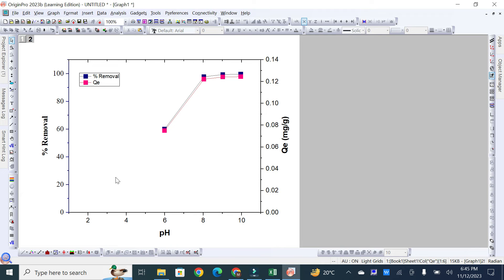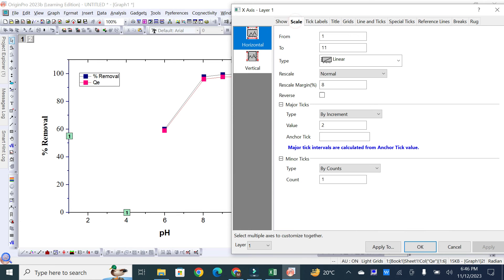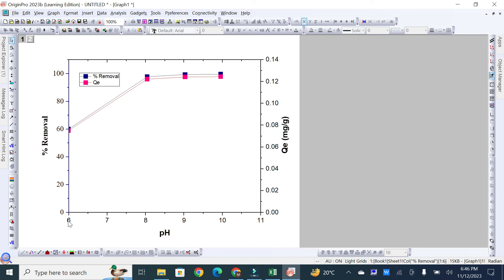If you want to remove extra space — for example, the graph is starting from a pH value of 6 but there is space before it — double-click on the axis value and a dialog box will appear. Go to Scale; you'll see the graph starts from 1 and goes to 11. Since our data starts from 6, set the start to 6 and end at 11. You can also set the increment — for example, selecting 1 — then click OK so the graph starts from 6 and goes to 11.